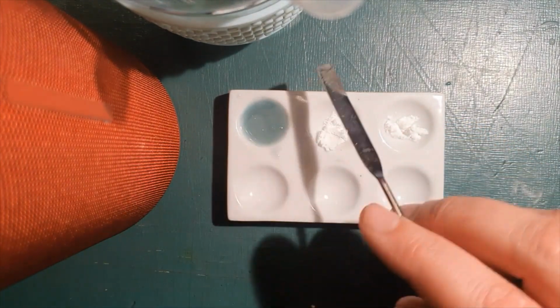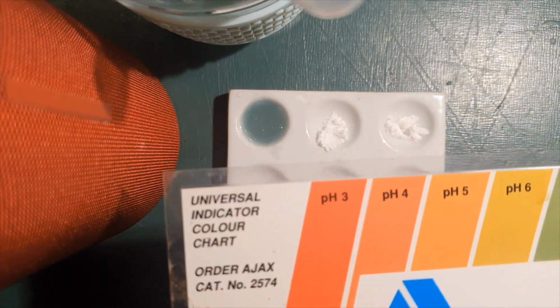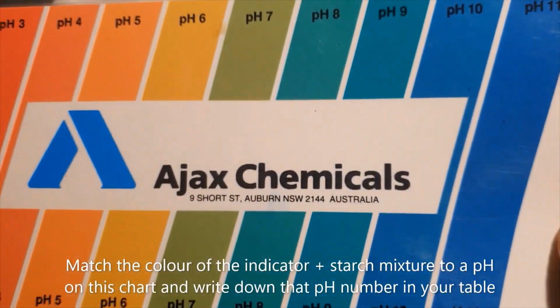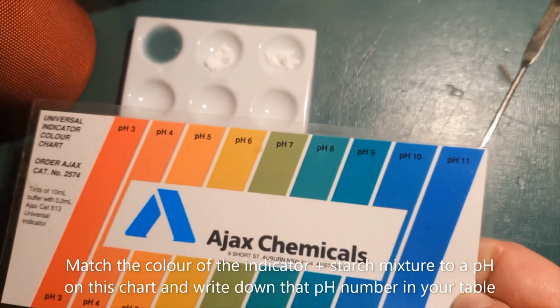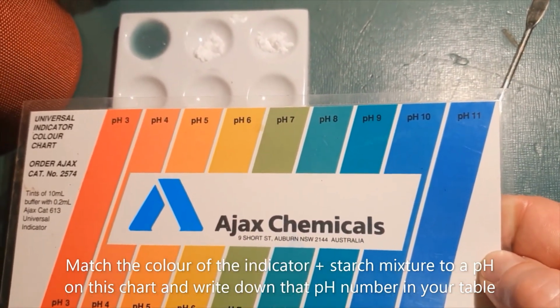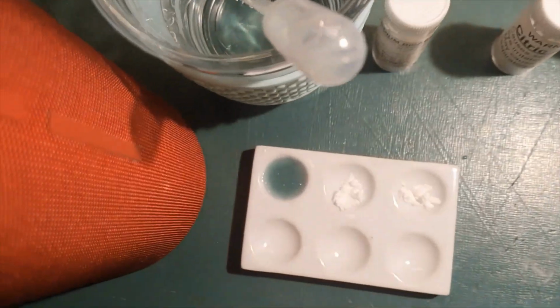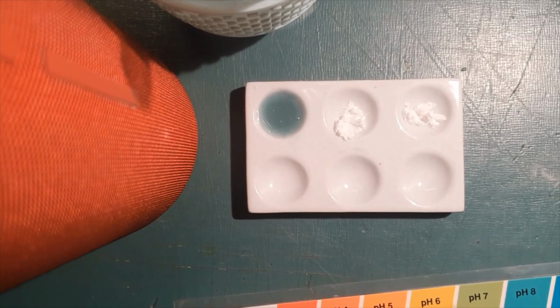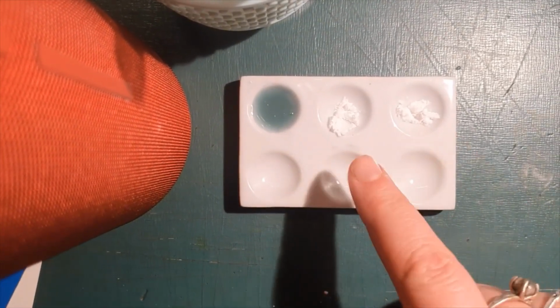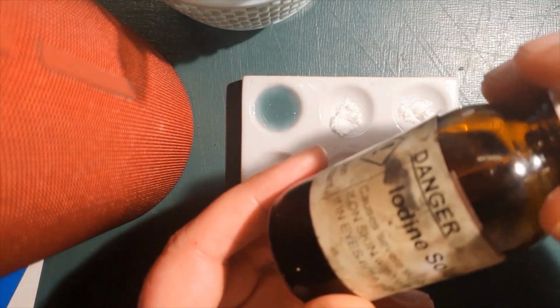Oh, look at that. It kind of matches my table. So you want to match up the color to the pH chart. Which pH do you think starch is at? You can write that result down yourself. All right. So this is still starch. These are all starch. We're going to test it with some iodine next.